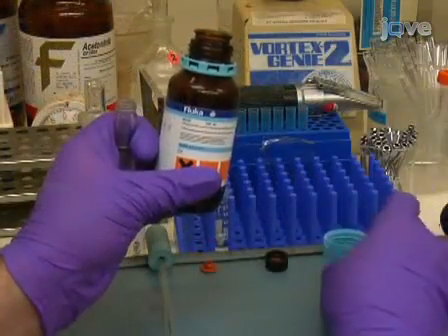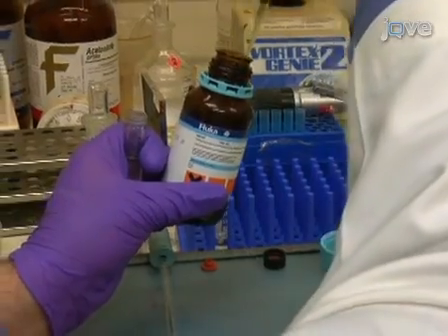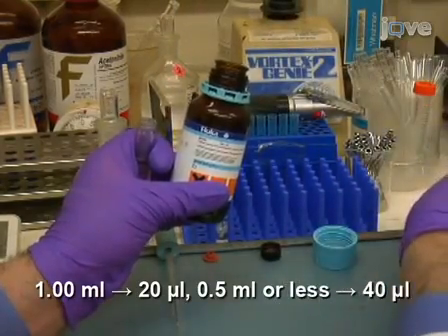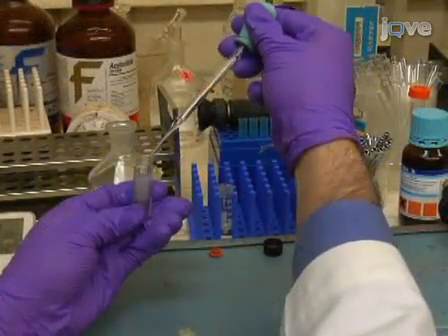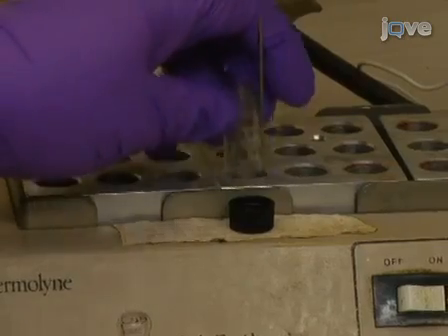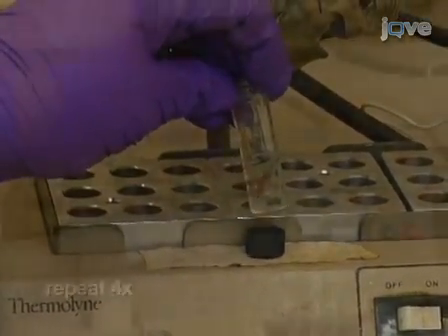Now add triethylammonium trifluoroacetate, or TEA-TFA, which is the catalyst for trimethylsilylation. For 1 milliliter samples, add 20 microliters, and for 0.5 milliliters or less samples, add 40 microliters. Top off with acetonitrile and place under a nitrogen stream at 70 degrees Celsius until constant volume is achieved, indicating that only TEA-TFA remains. This takes about 15 minutes.